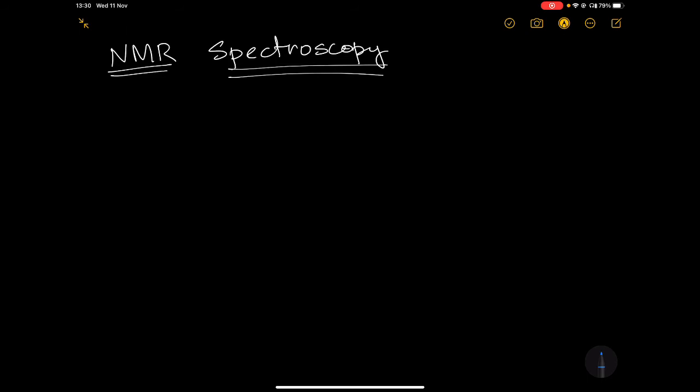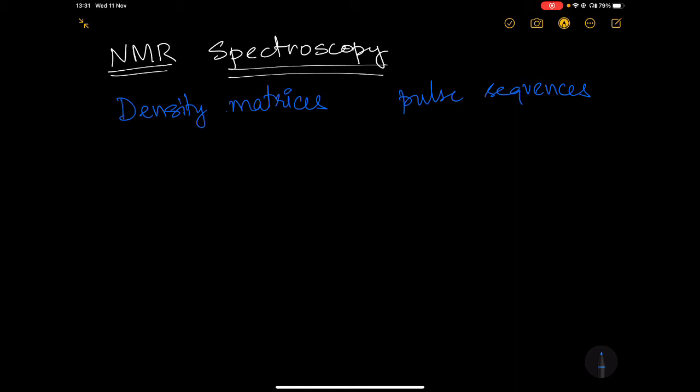So far in the NMR spectroscopy course, we have learned how to use the theory where we calculate density matrices as a function of the pulse sequences that we design to help us get the desired result. We were able to exemplify this with the help of the distortionless enhancement by polarization transfer, which helped you obtain a 13C 1D NMR where CH, CH2, CH3 spectral editing is possible.